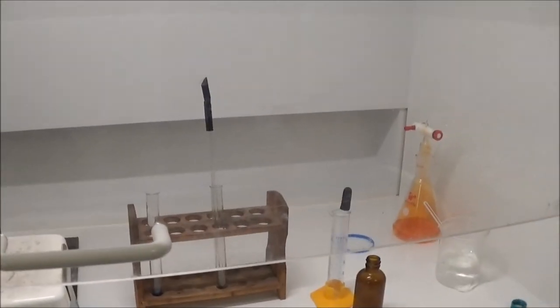The next part was the back. A piece of 1/4 inch plywood makes up the baffle, and behind that is another box made of 1/2 inch wood, which just gives it some space so there's room for the air to flow behind the baffle.